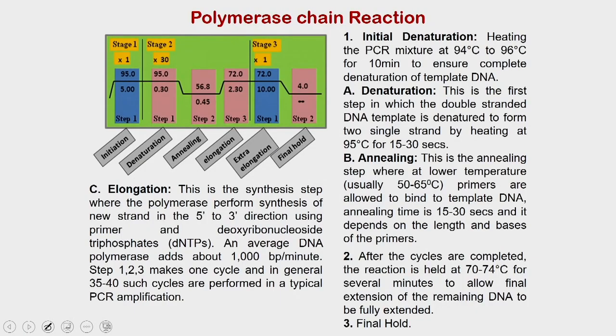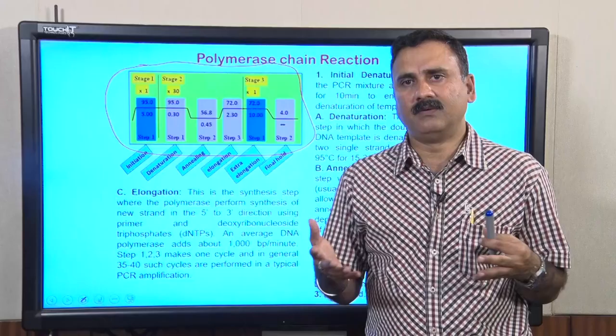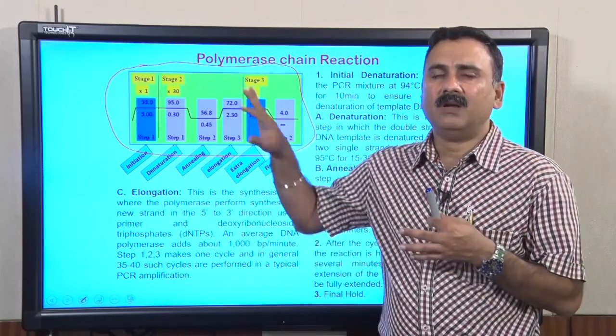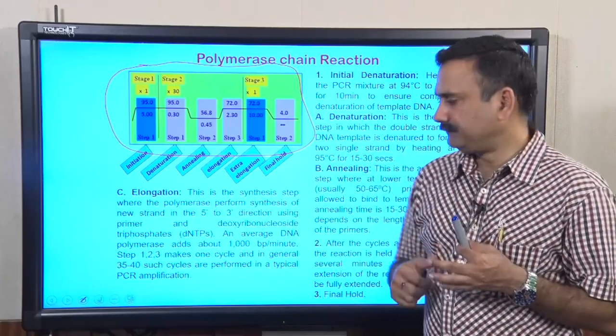Now moving on to the third thing, which is about the PCR reactions. They will not only let you discuss the PCR reaction, they will also let you discuss how to set up the cycles onto the machine and how to operate them. The machine we have in our laboratory may not be the machine available in your institution or setup, but more or less the steps remain constant, whether it is a machine from one company or another. Only a few buttons may be different, or the way you operate these machines may be different, but the overall basic principle remains constant.